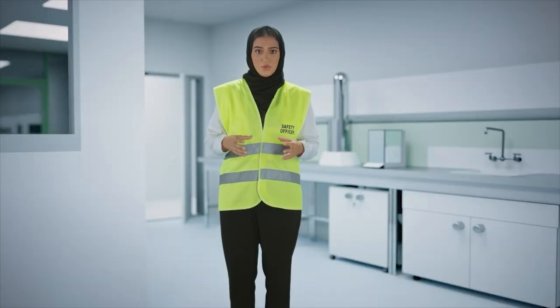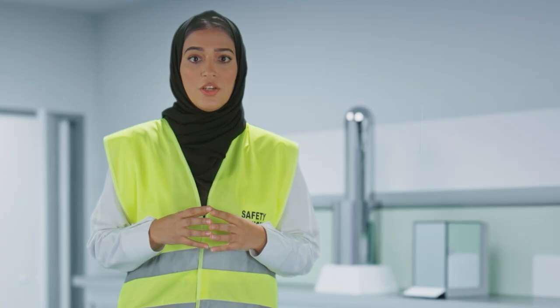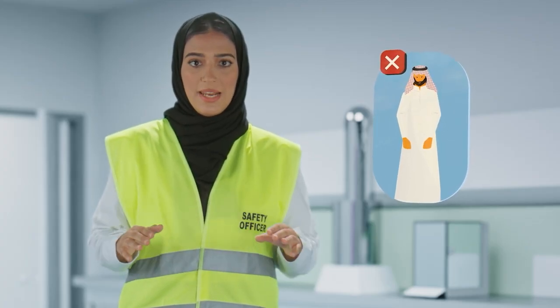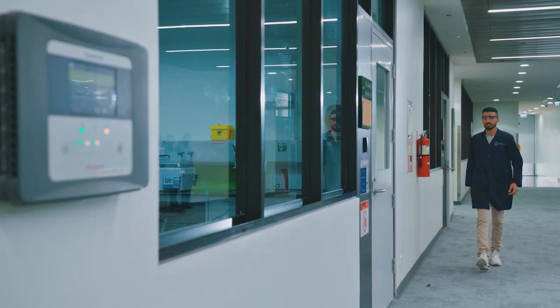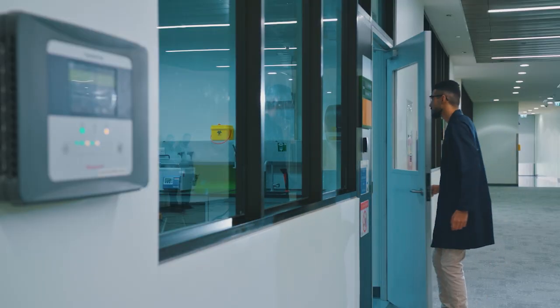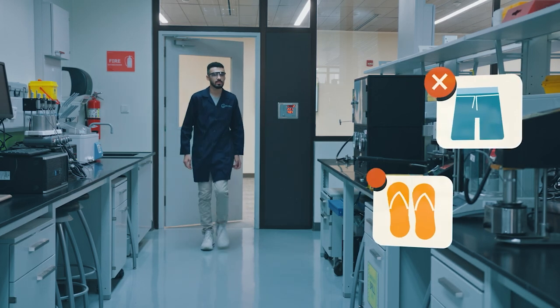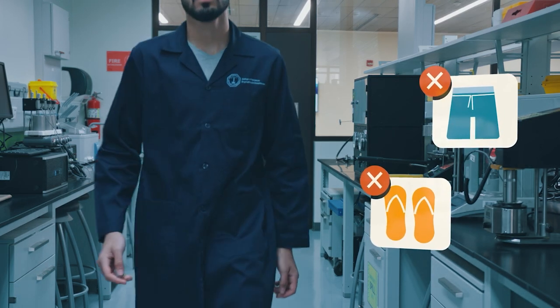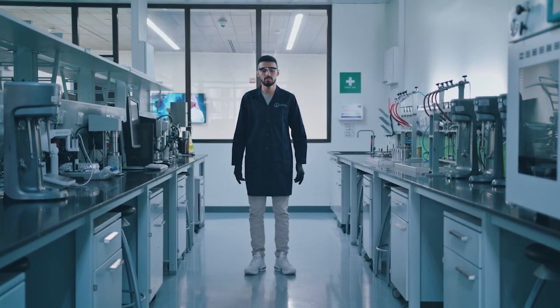Clothing worn in the laboratory should offer you basic skin protection from splashes and spills. Dress appropriately for the laboratory work. Thob and ghutra are not allowed. Before entering the laboratory, you must always wear long pants and proper closed-toe shoes. Shorts and sandals leave skin exposed to possible burns and other injuries. Therefore, they are not allowed.